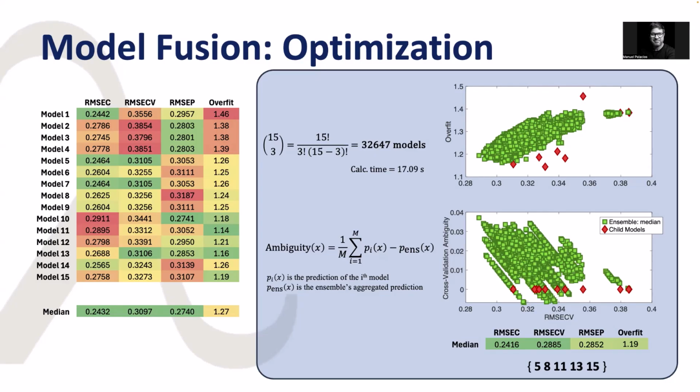You want the ensemble of models to be diverse, because if you have more diversity in your responses, for example, one of the models is predicting high and some of the models are predicting low, and if those high and low are very different, your model at the end is going to be able to produce a more accurate prediction, depending on where you are in your reference. But we're going to talk a little bit more about that later.